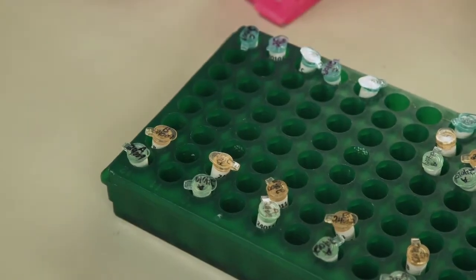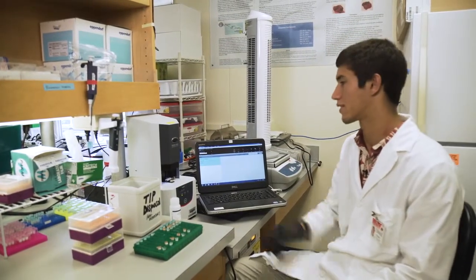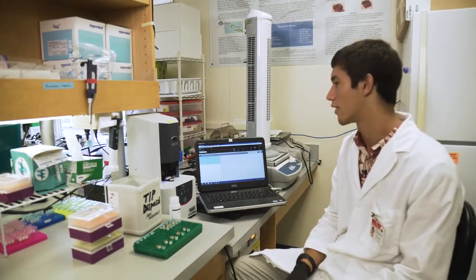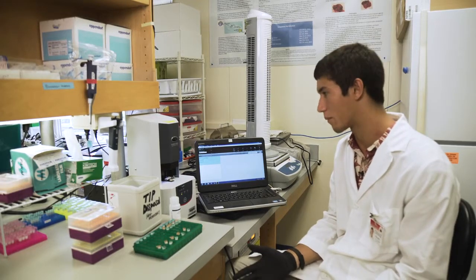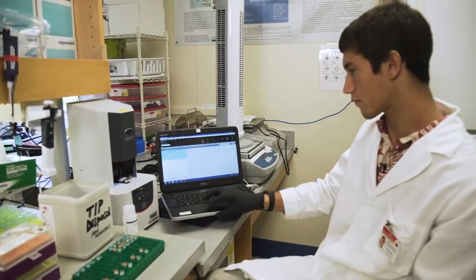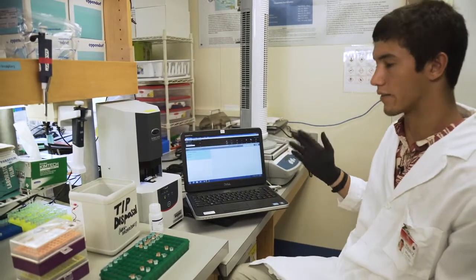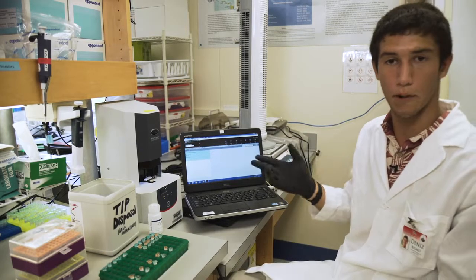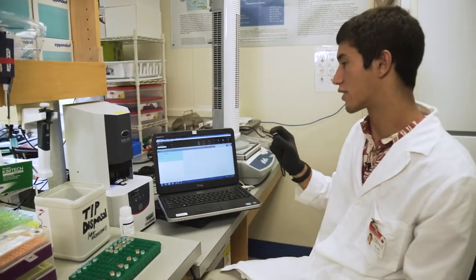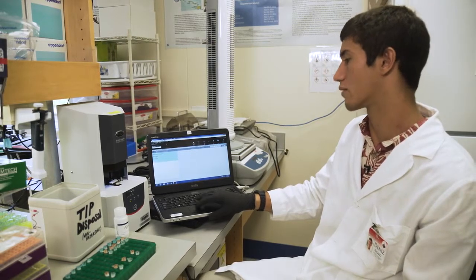For our next step, we get to look at our samples on this guy, our BioSpec Nano. It's a spectrophotometer, and it's a big fancy word broken down: spectro for spectrum, photo for light, so it's a light spectrum meter. DNA has a couple unique properties when you shine light through it. Because of the molecules and chemicals that make up DNA, some of them absorb light at very specific frequencies. So we have 260, 280, 230.